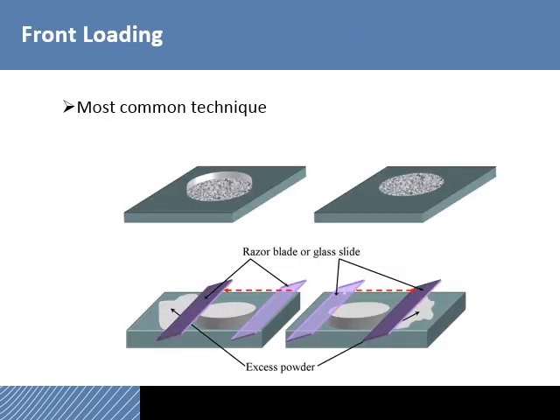Okay, the most common technique, this slide is actually kind of old at this point. Front loading is actually not the most common technique. Back loading is the most common technique now. This is a slide from the days when the sample holder would just fit directly in there. It was nothing but a plate with a cylindrical well in it. What you would do is fill this well with your powder and then use something flat like a glass slide or a razor blade to scrape off the top of it.